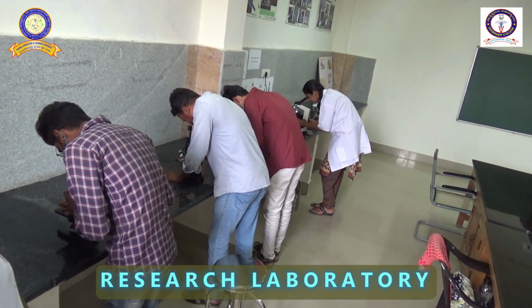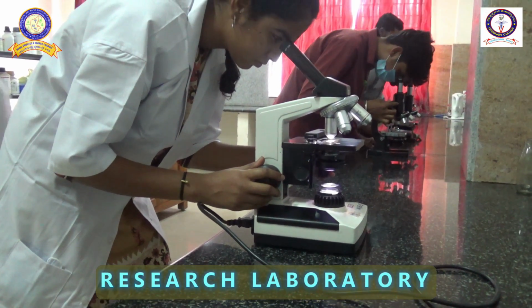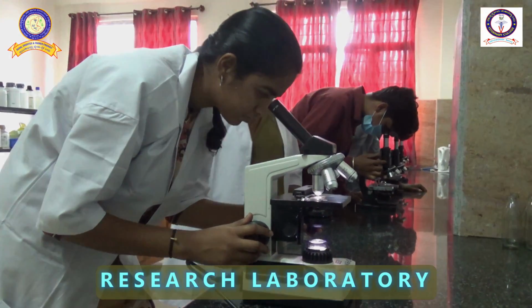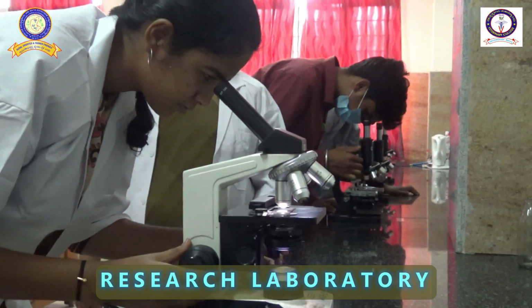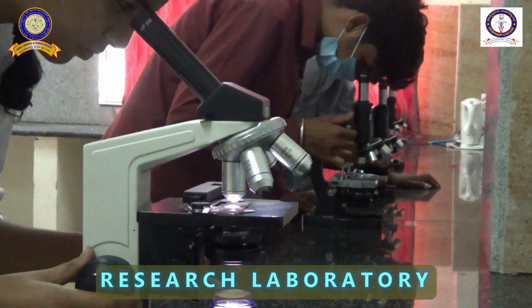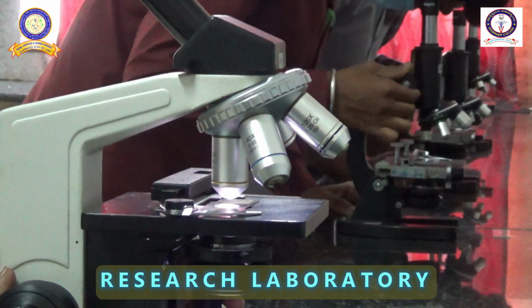Along with this, we also teach basic genetics to undergraduate students, for which we have the microscope facility to show the different stages of Drosophila and also the phenotypes of different Drosophila, and to see the mating plan and how the inheritance pattern happens.